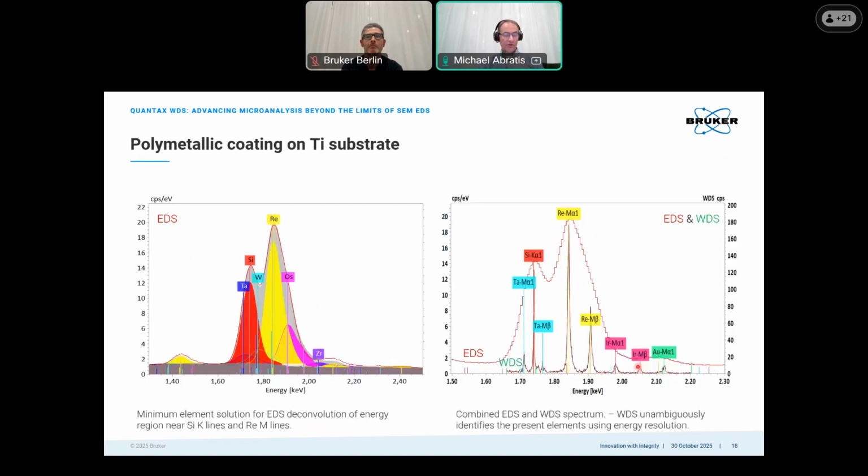Can we? Or should we prove it? Should we get more evidence? And for this, we take the WDS and make a range scan. This is what we see on the right-hand side.